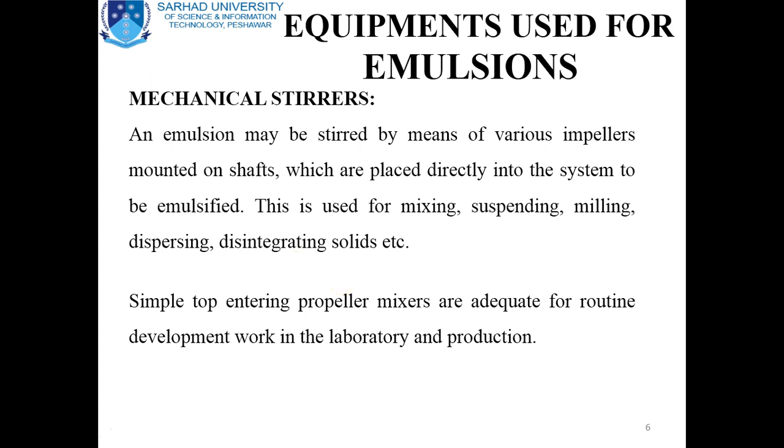Not only are mechanical stirrers used for the emulsification process, but also for the process of mixing, suspending one material in another, milling, the particle size reduction, dispersing one phase into another phase, that is emulsification, disintegrating solid material, and several other functions as well, such as solution formation, and the rate of solution formation may be enhanced by the stirring process.